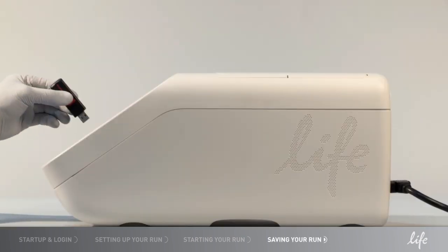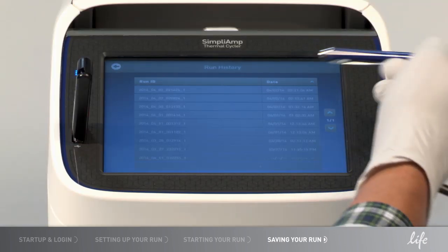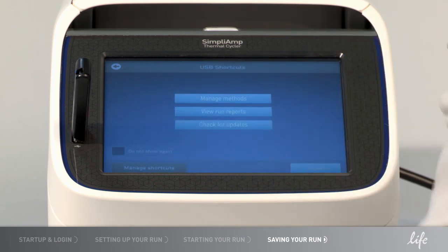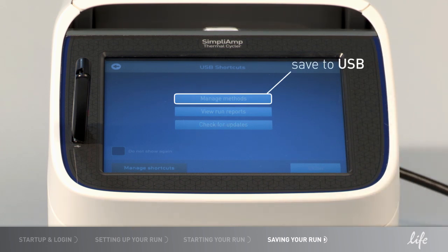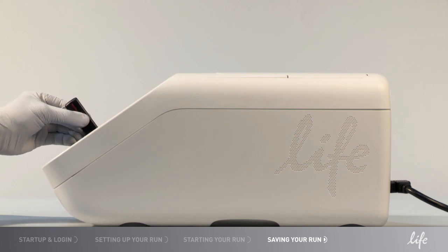If you would like to save the protocol to a USB drive, plug in the USB drive at the front of the instrument. You can transfer your methods to and from the USB drive, or run a method from the drive with Manage Methods. You can view and verify your previous experiment reports with View Run Reports, and update instrument firmware with Check for Updates. Select Manage Method to save to the USB drive — it is easy to run the protocol with the USB drive on another instrument.